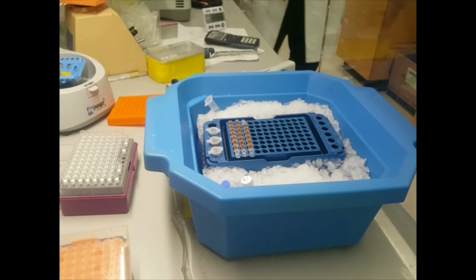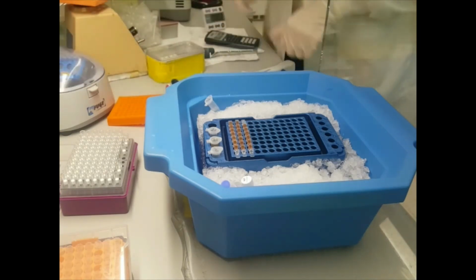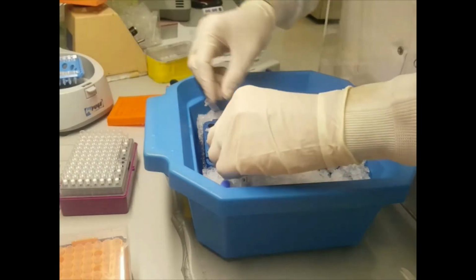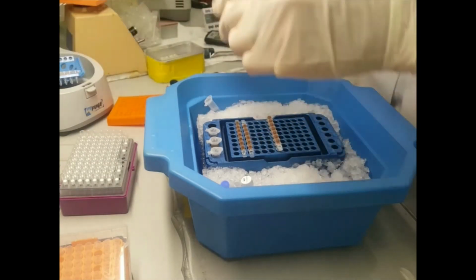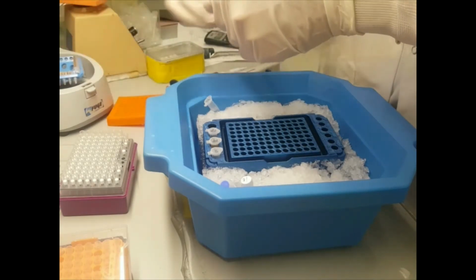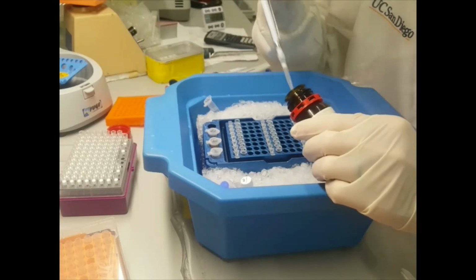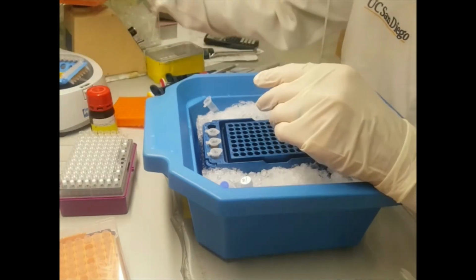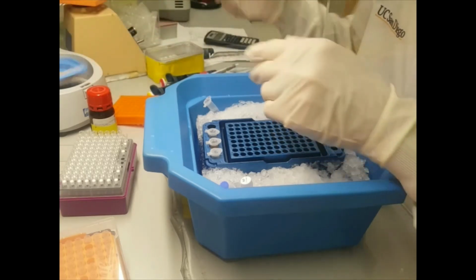For this step, add 50 microliters of AMPure XP RNA beads into the lids. Once the reaction is completed, quick spin the samples and place them on ice. Remove the caps and exchange them with the lids that contain the beads. Mix the sample well, quick spin, then remove those lids, but keep them. Add 1 total volume, or 100 microliters, of 100% isopropanol. Close the sample. Mix again well, quick spin, and incubate on ice for about 10 minutes.